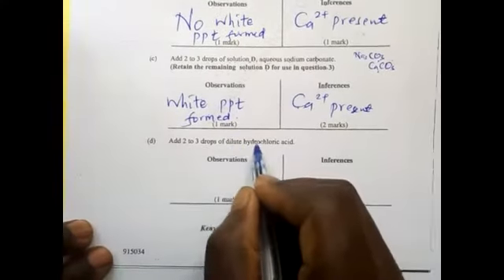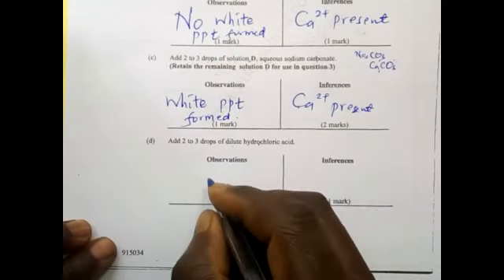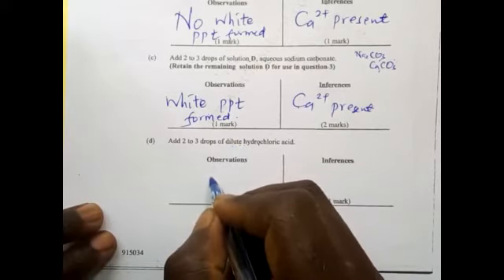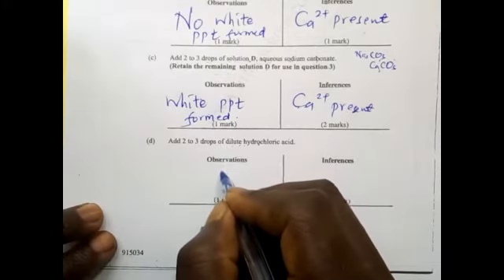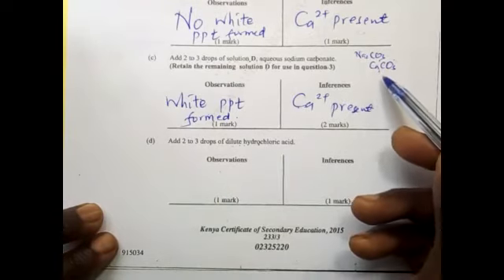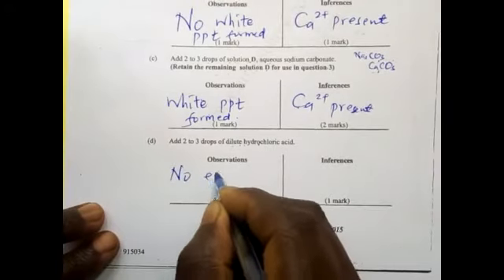We are adding dilute HCl, 2 drops. And then, remember here, we expect effervescence. But why are we expecting effervescence? If there was a carbonate inside there, because we have said calcium carbonate, it will form effervescence. But in this case, there is no effervescence.